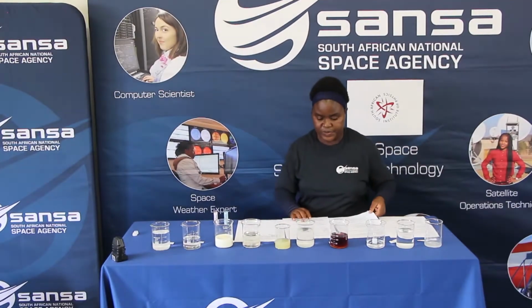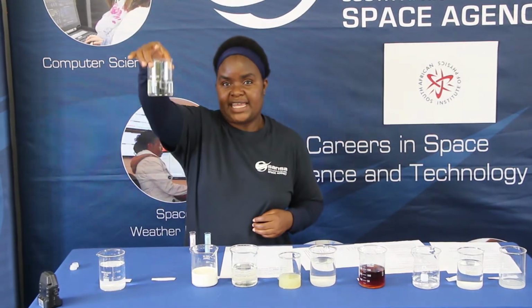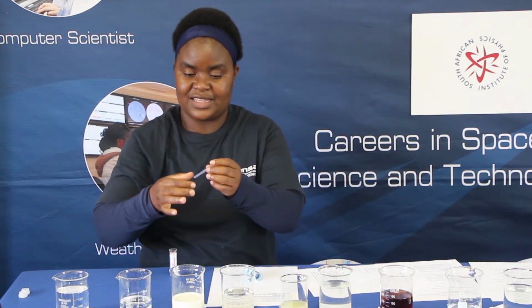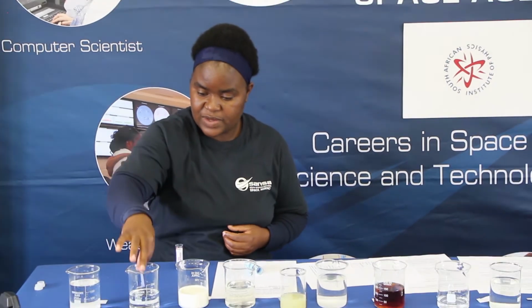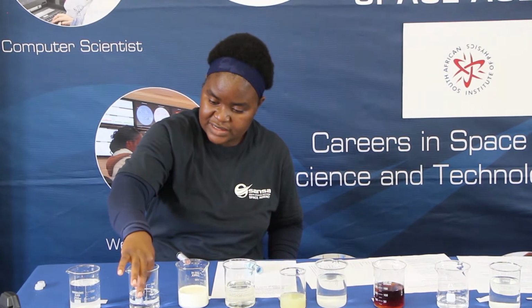Okay, so the first one that we have from our table is water. We're going to see what happens if we dip a blue litmus paper into water. Does it change color to blue, pink, red, green, or yellow? Just observe and see what happens, and then you can tell me. Here, the blue litmus paper is going into the water. Just observe what is happening. You see? Nothing happened.